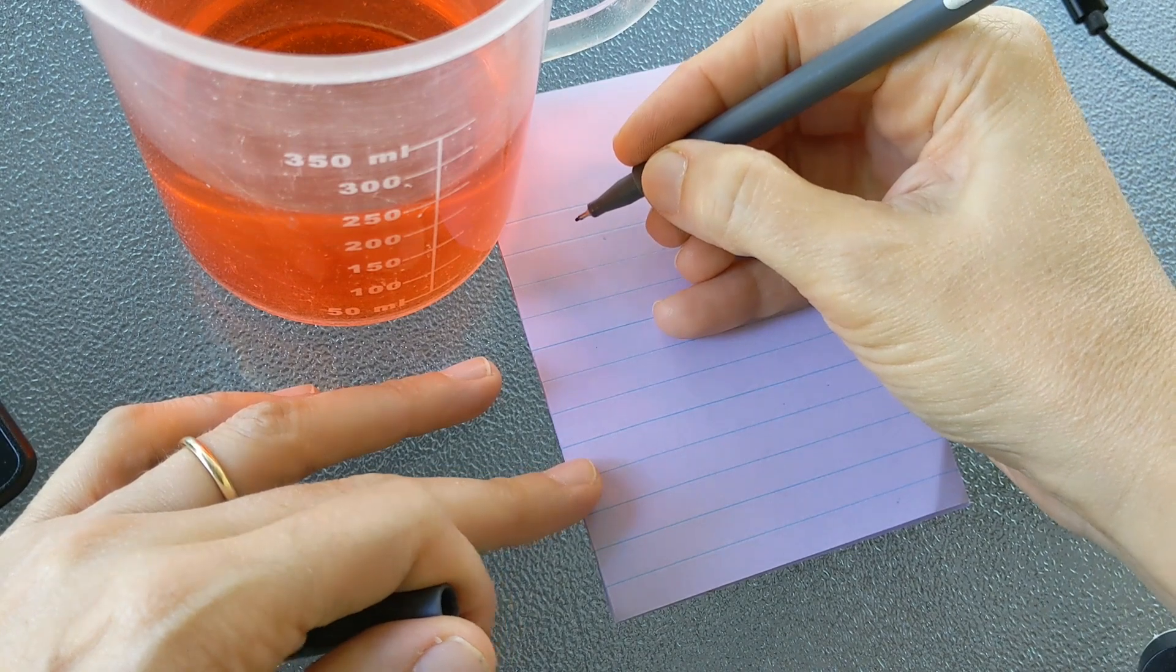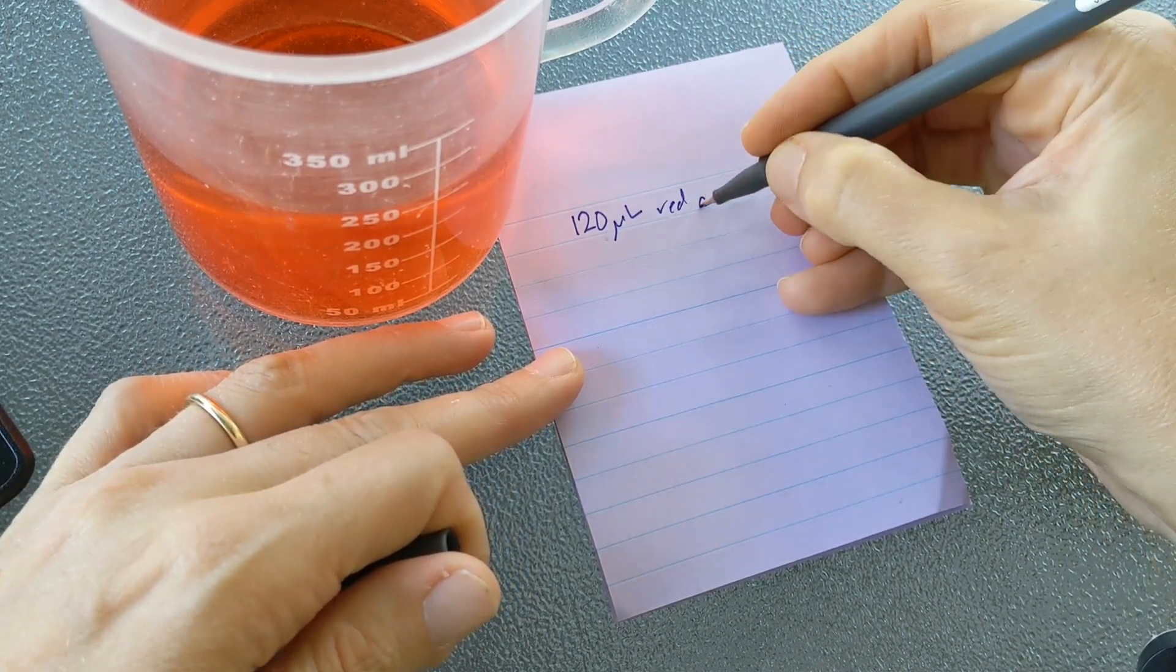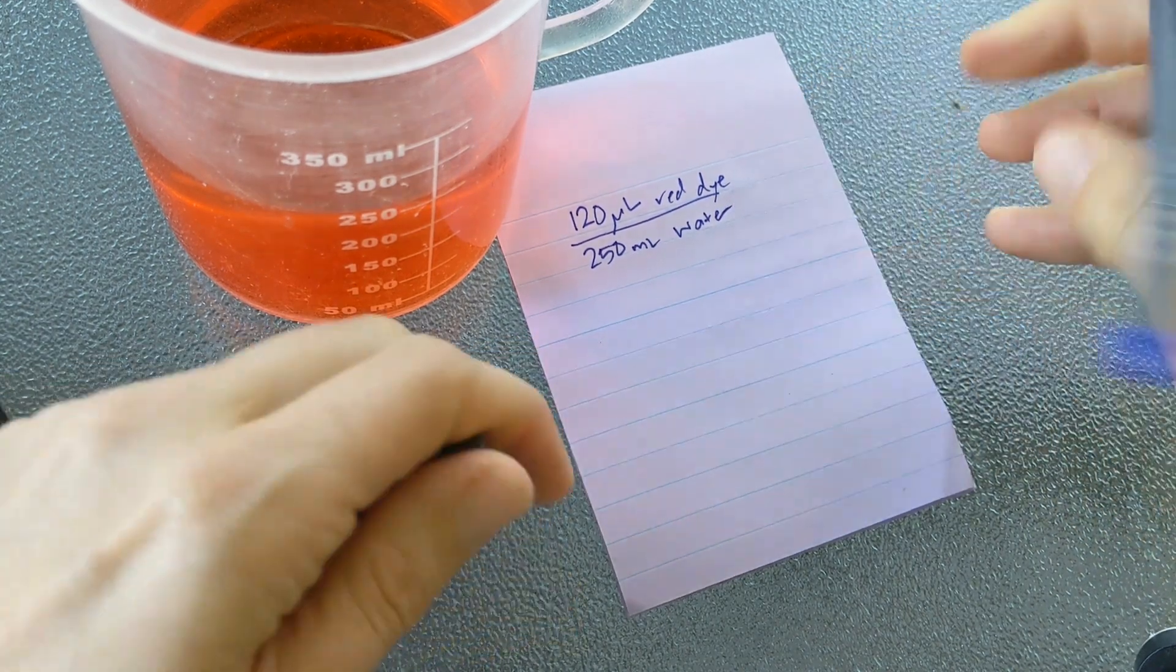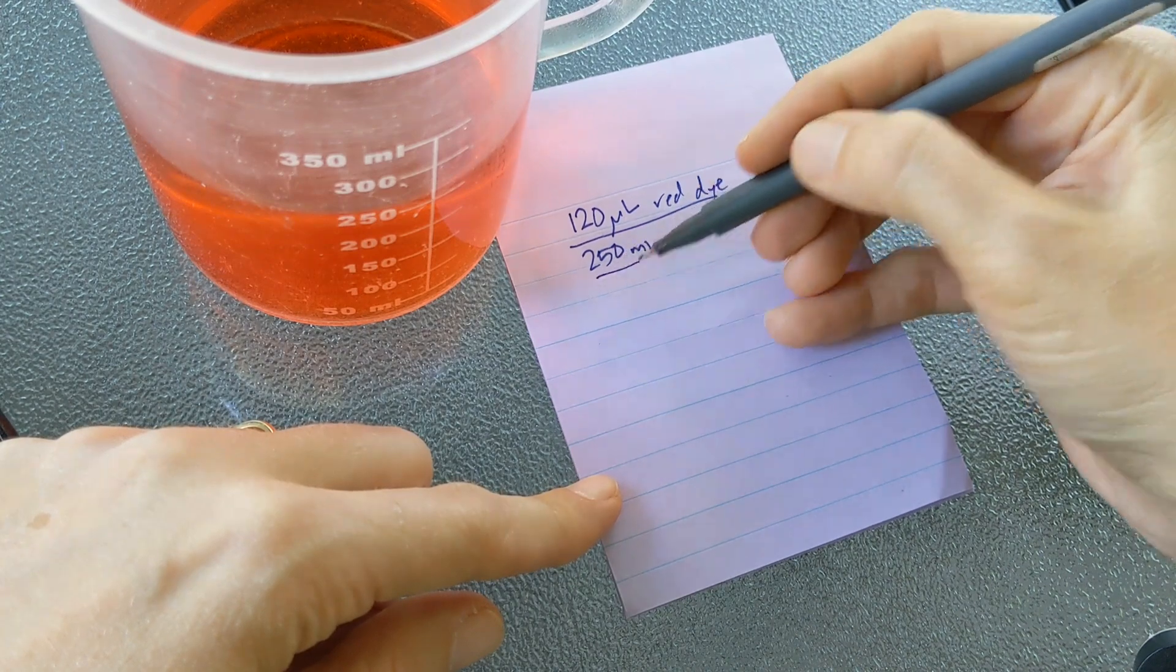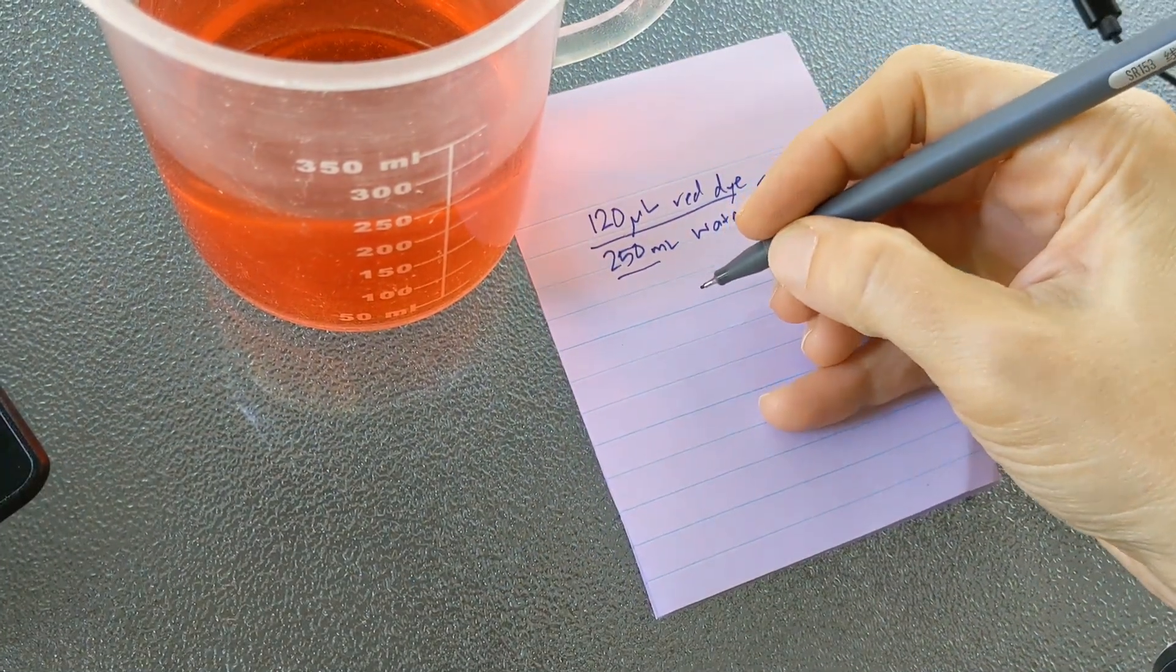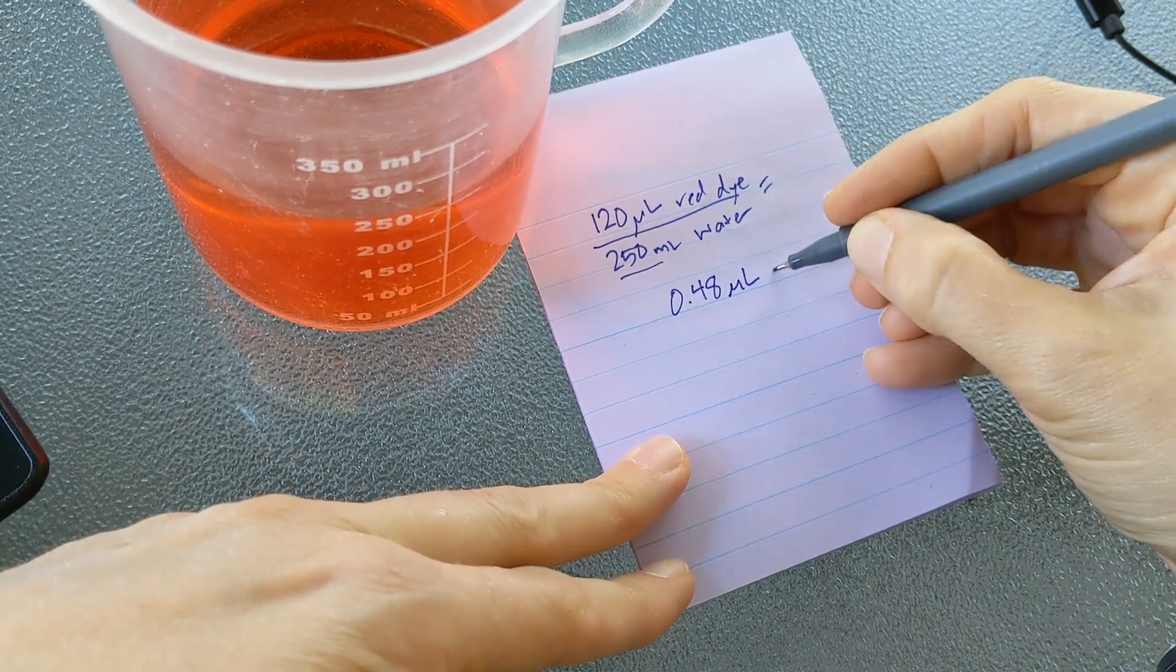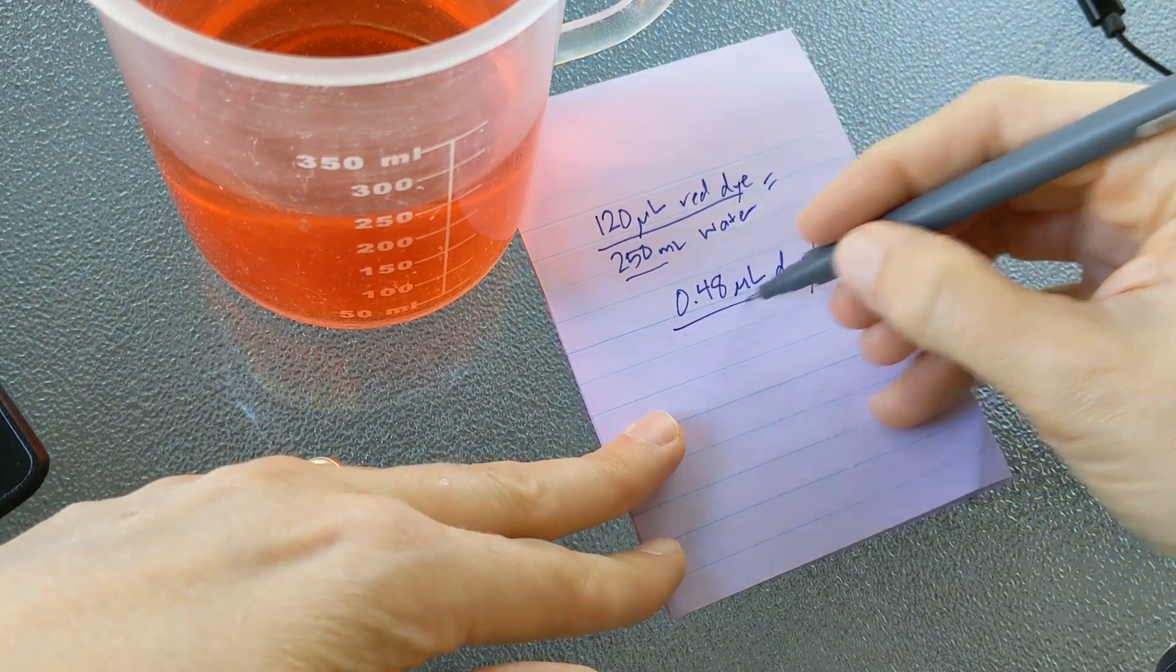So I added 40, 40, 40. I did it three times, so my total amount of dye was 120 microliters of red dye, and the amount of water that I added it to was 250 milliliters of water. That's my total solution. I don't have to add my solute because it's in a unit that's a thousand times smaller, so it doesn't make any measurable difference to the total volume of my solution. Then I calculate it out. Couldn't do that in my head, so I had to take a quick visit to my calculator. It comes out to 0.48, and it's really important that they write that as microliters of dye per milliliter of solution, or at least microliters per milliliter. This is our mystery solution value.